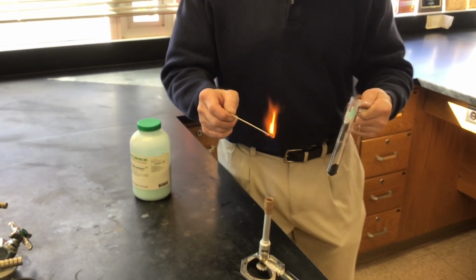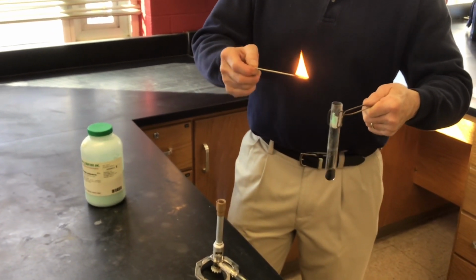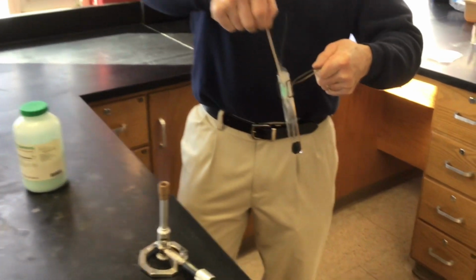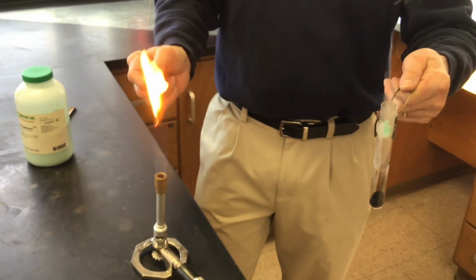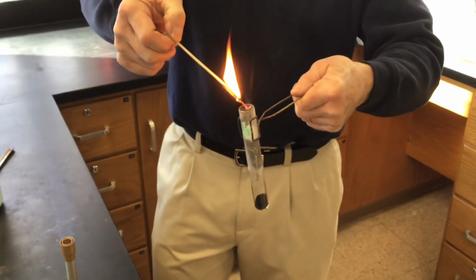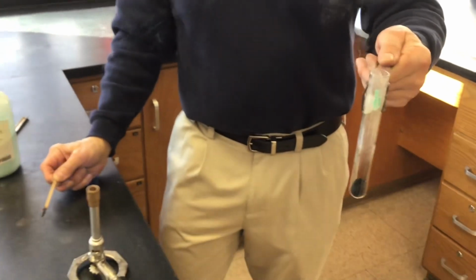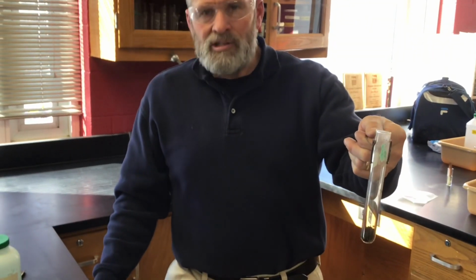Okay, so let's try this out. Make sure this is well lit. Okay, very well lit. And you stick it into the test tube, and it goes out almost immediately. Okay, there's the flame. Gone. Wow. Okay, so whatever's in here extinguishes that flame.